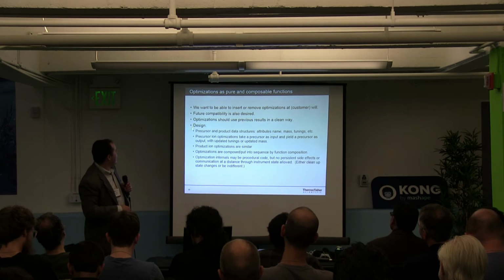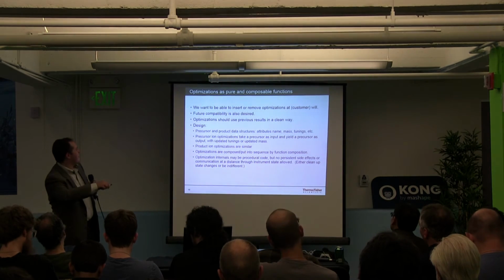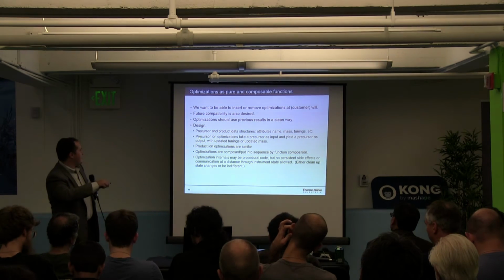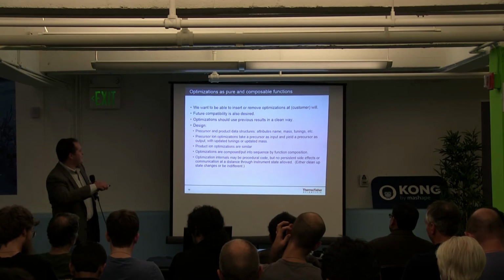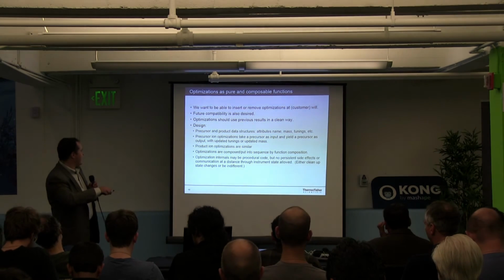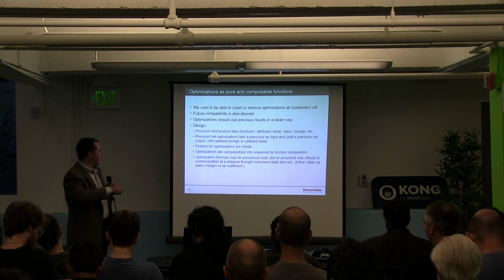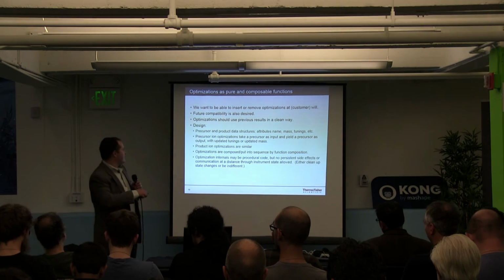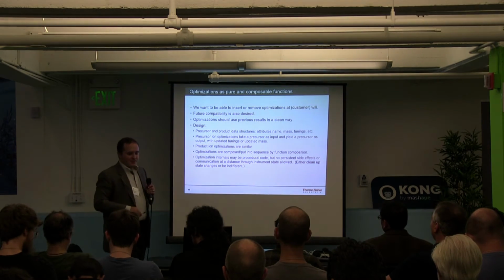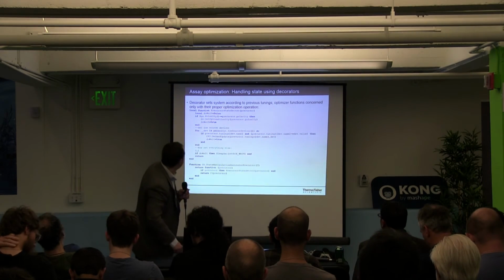So the design is that we have precursor ion and product ion data structures that are inputs. All of the optimizations then return one of these. When there's a tuning table, it gets updated. The optimizations are composed by function composition. And these optimizations might be procedural code, but we handle all of the state manipulation through a decorator.